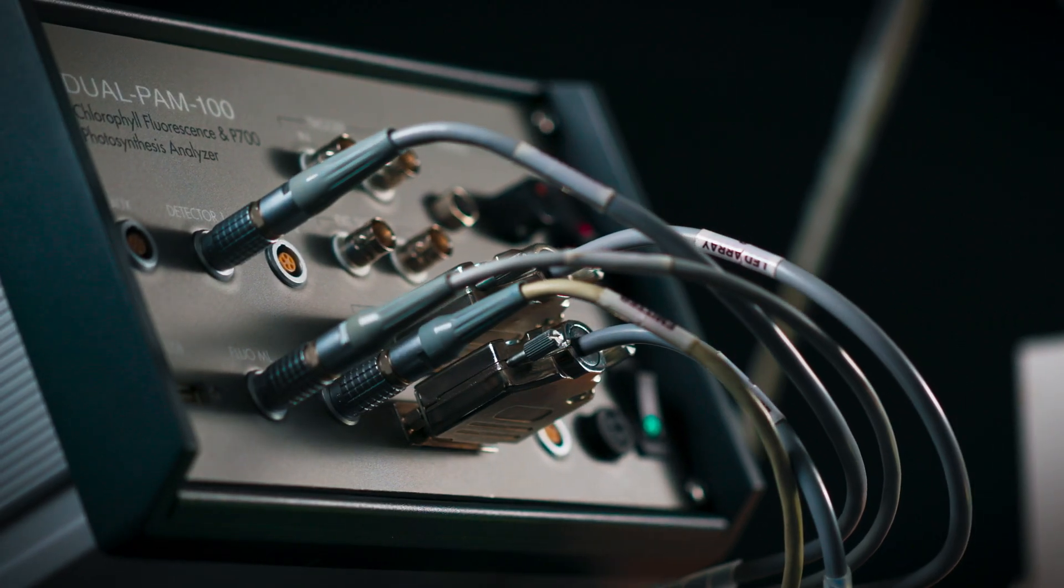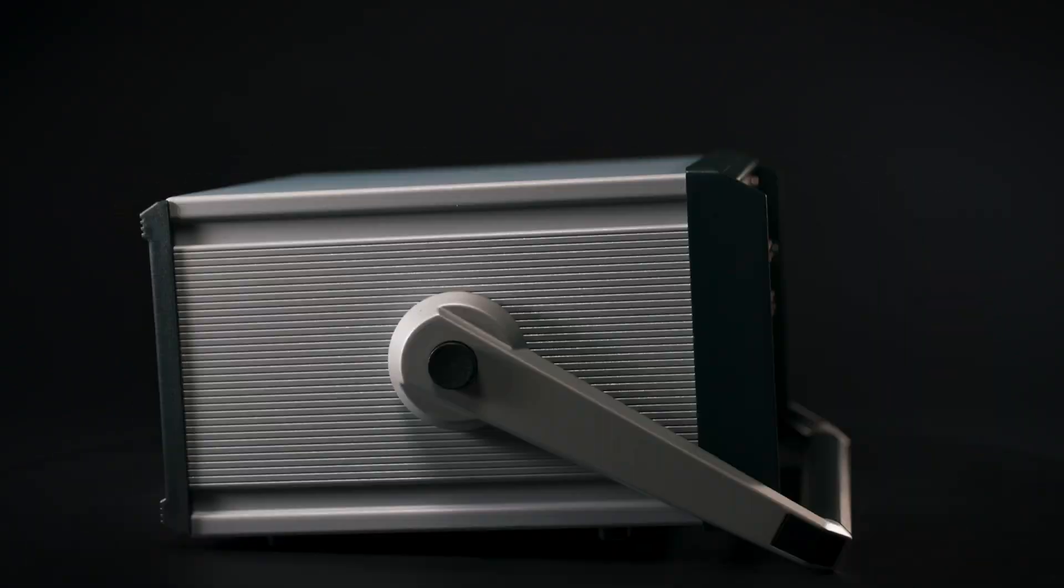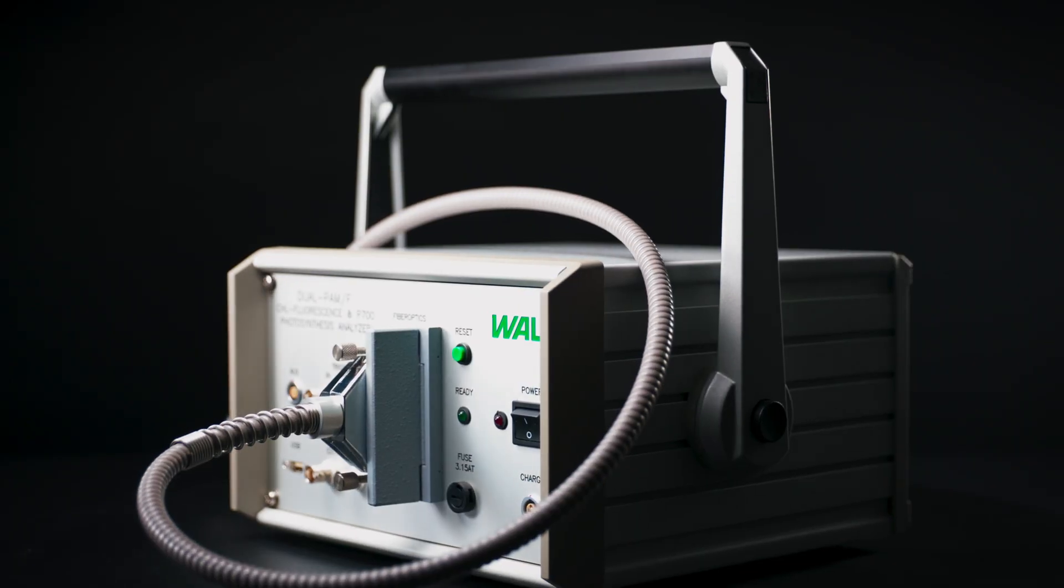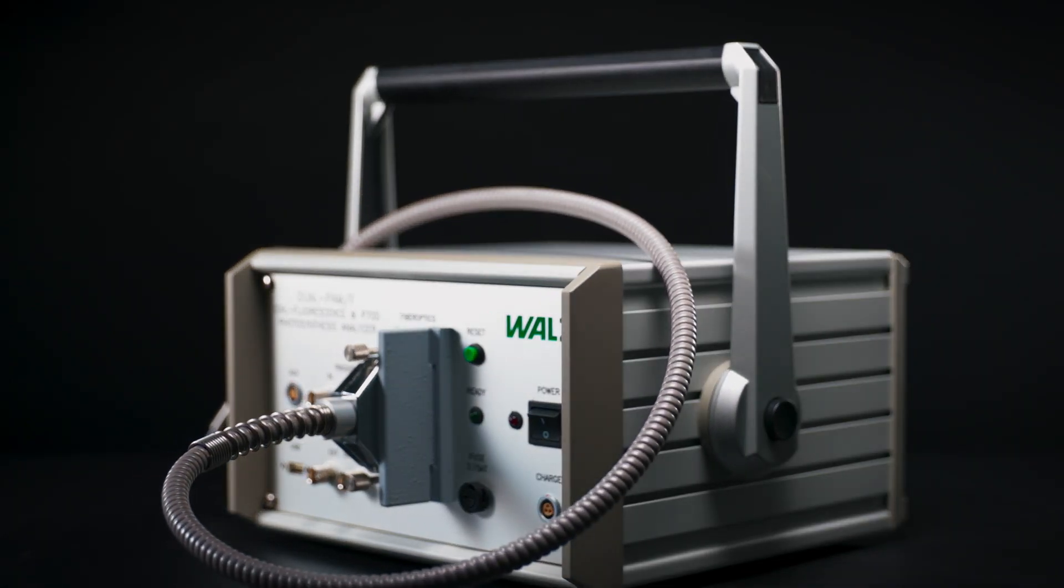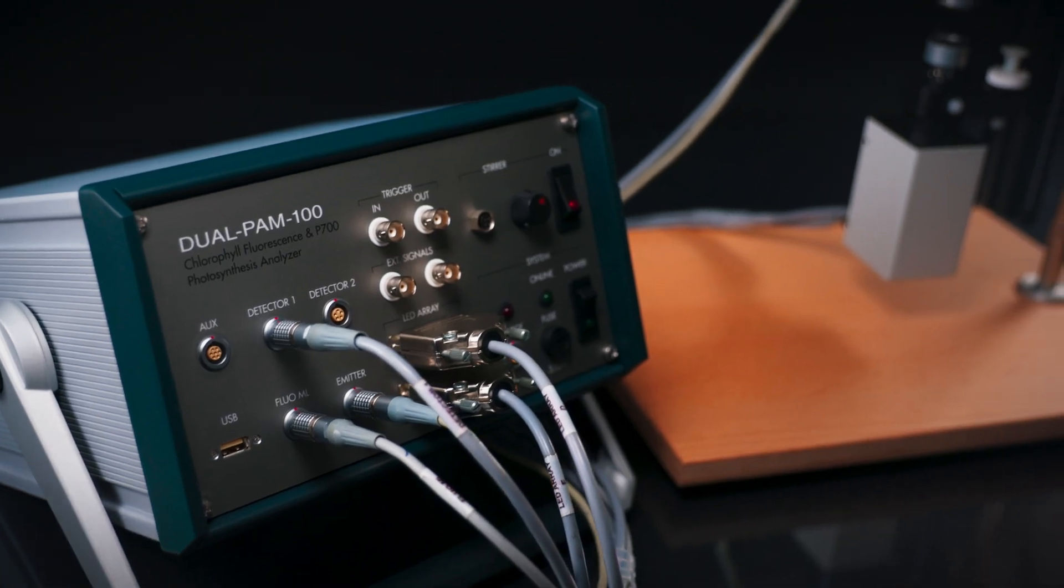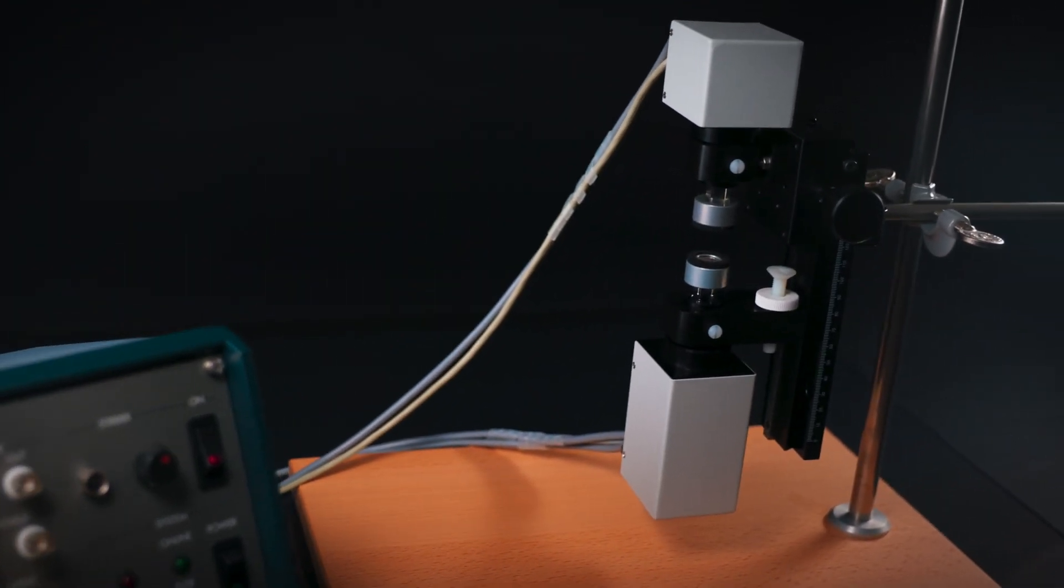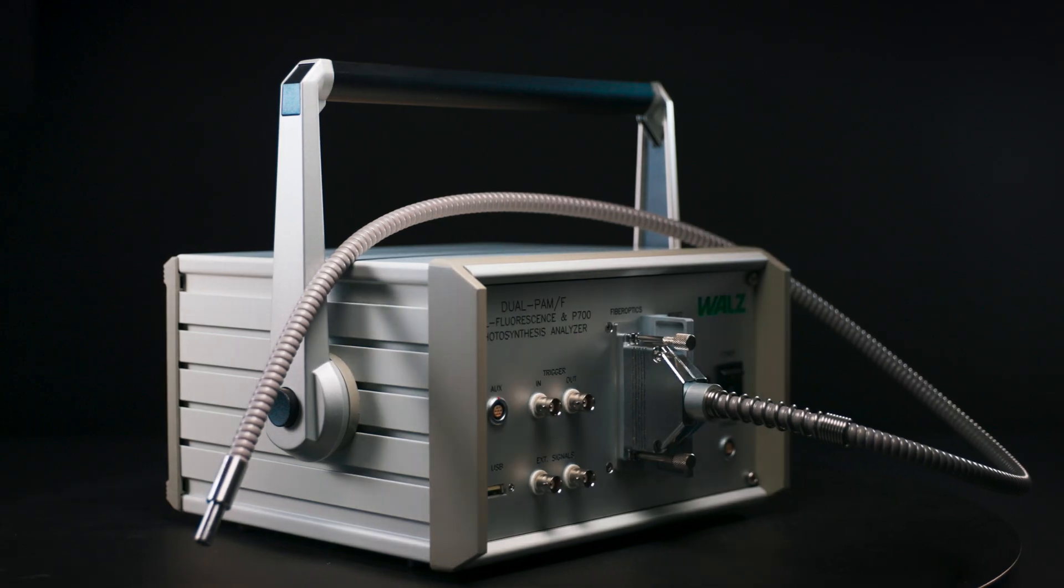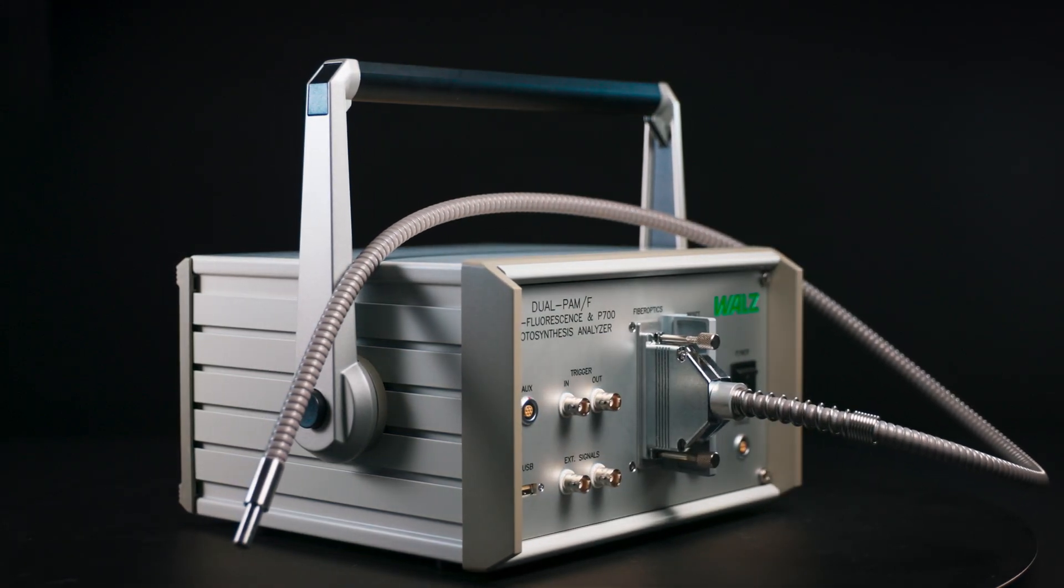Dual PAM systems are available as modular and fiber versions. The modular version consists of separate controls and detector units. The fiber version integrates all components in a single housing.